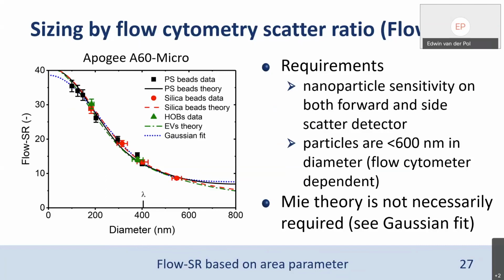But before Frank Coumans left the lab, he did a funny experiment. One morning, we decided not to have breakfast at all and apply flow SR to measure what we named the lipoprotein particle concentration. And then one day later, we changed the experiment.